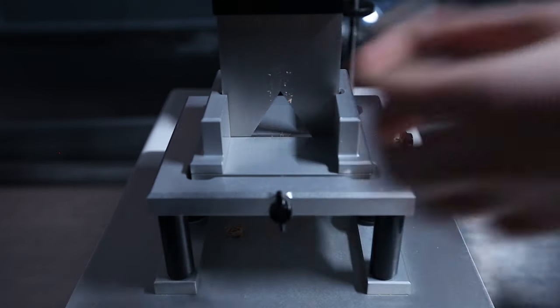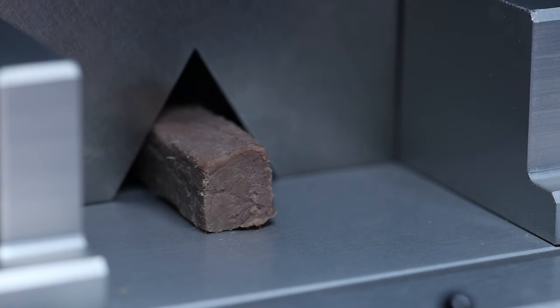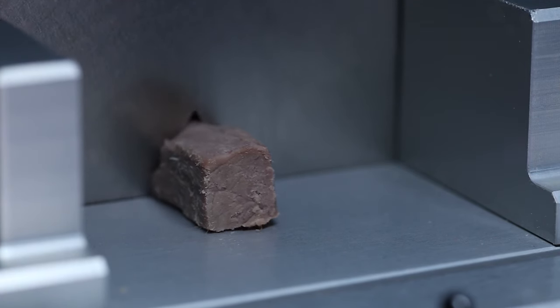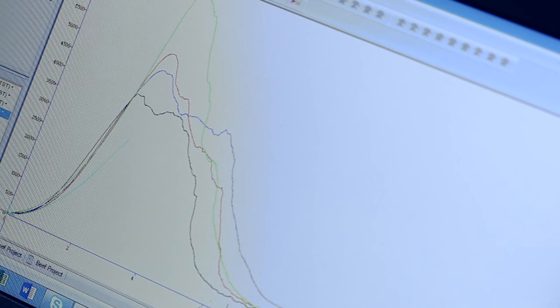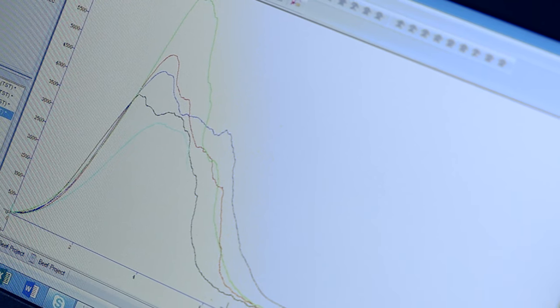When carrying out the shear force test, place the core under the blade in the centre. The blade will move down and shear through the sample to give a reading of the peak force applied.